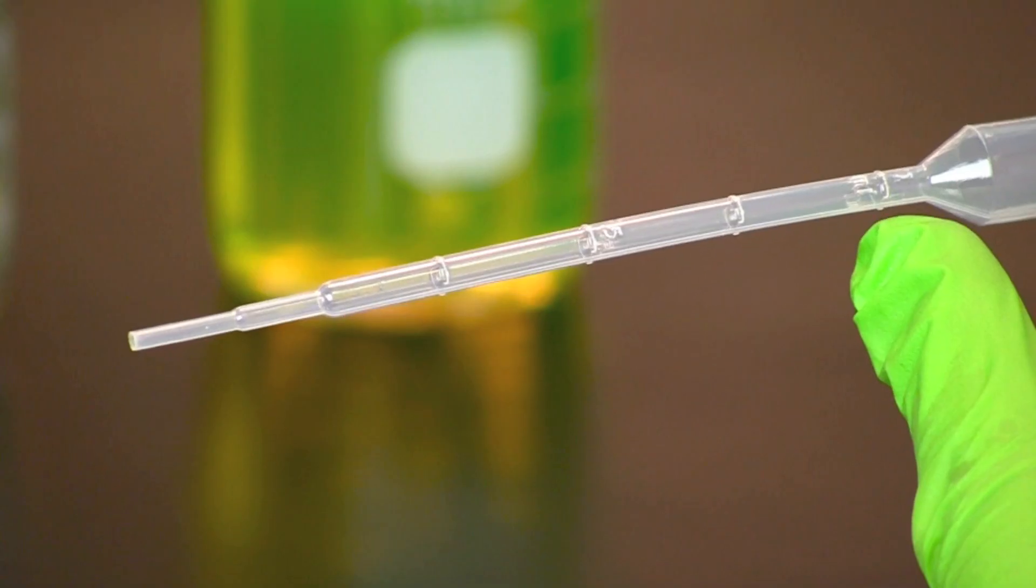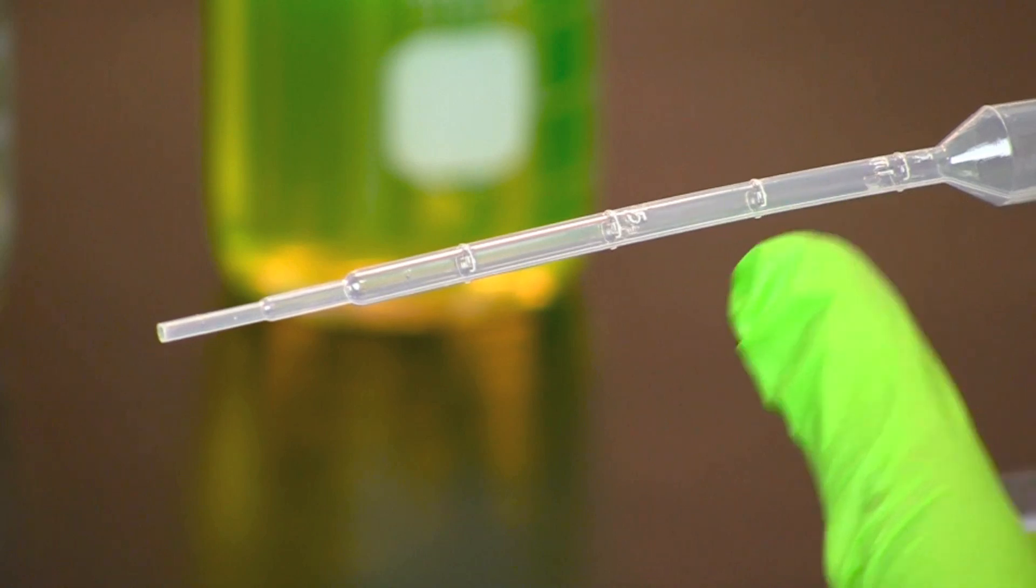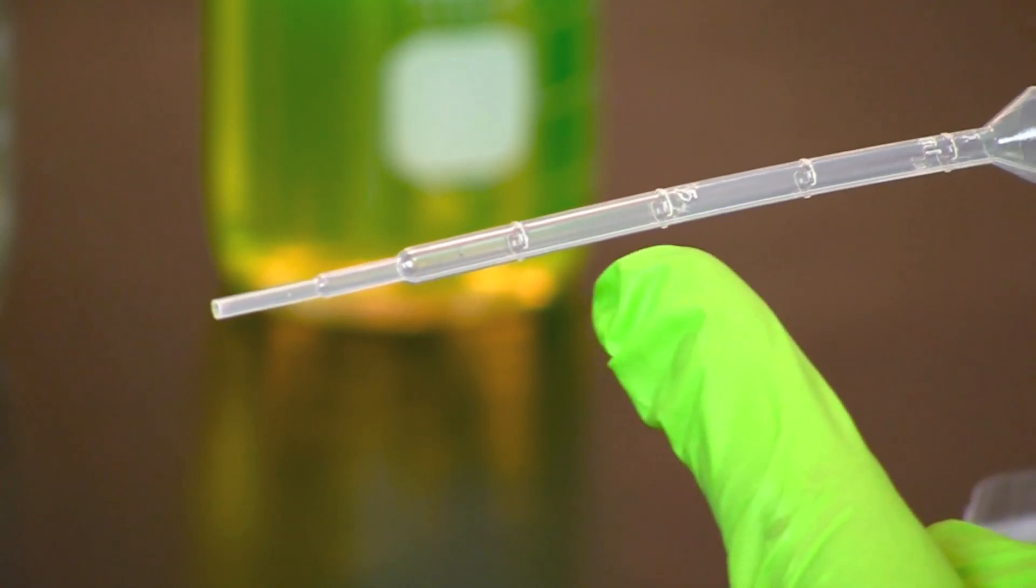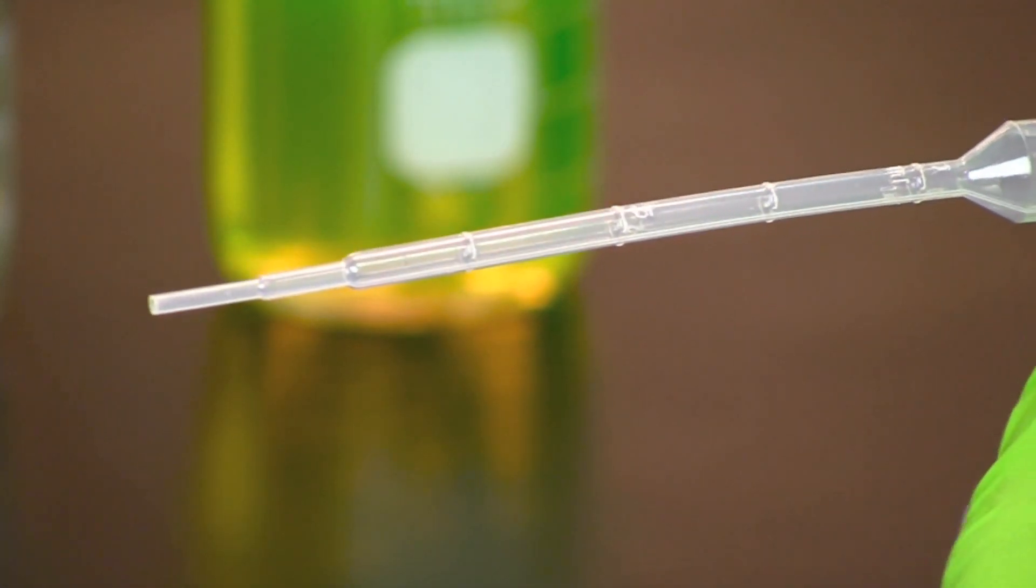Markings on the pipette allow the measurement of 1 milliliter, 750 microliters, 500 microliters, 250 microliters, 100 microliters and 50 microliters.